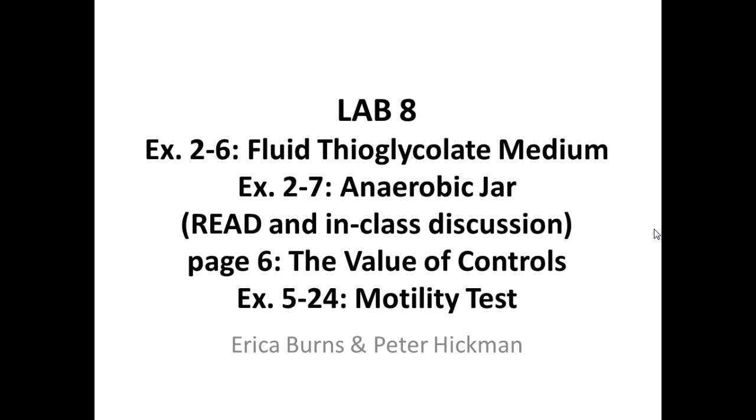Of gram positive versus gram negative to be able to compare to our unknown. And so today, after I lecture, after we record our results for FTM and then also motility test, then you guys will create some more smears for staining, and you also stain your gram slides that we made last week.